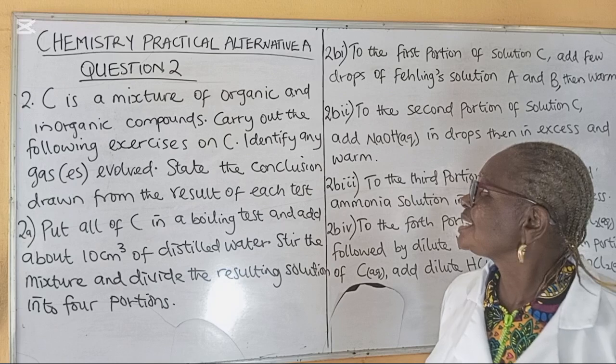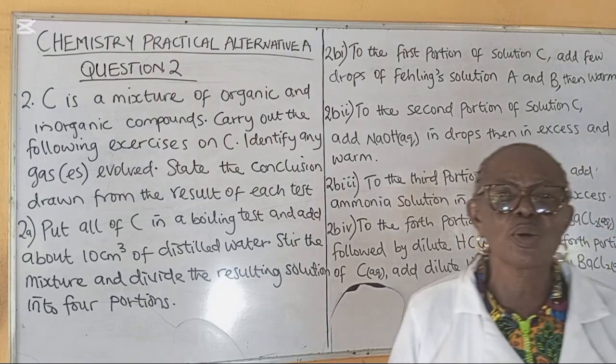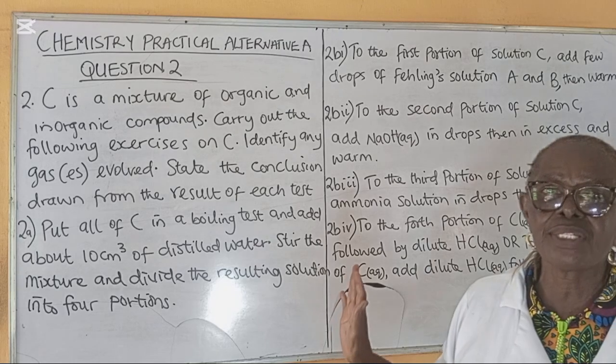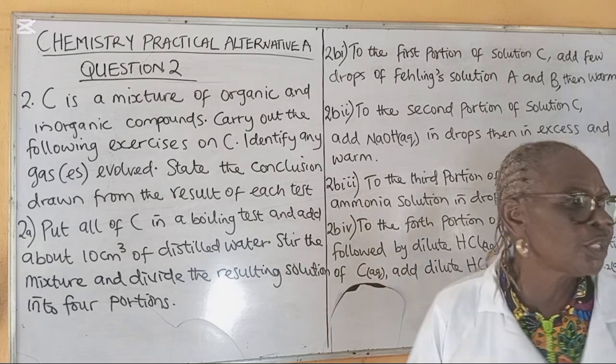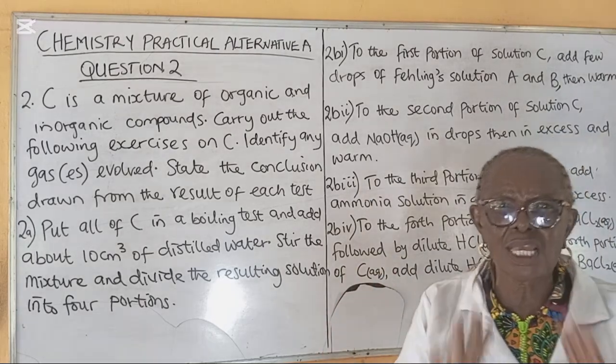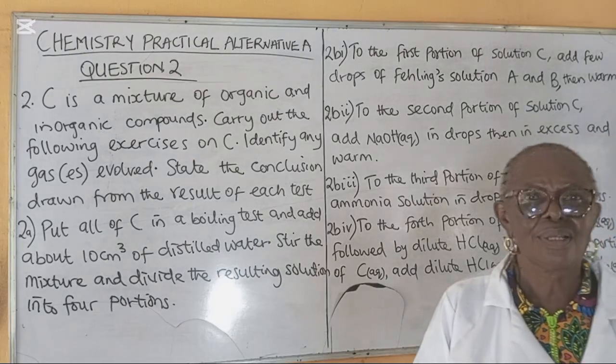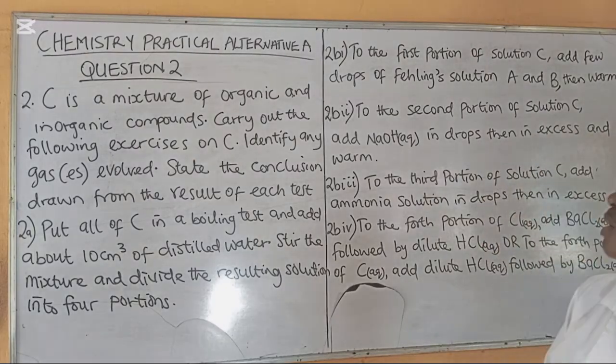Okay, my viewers, this time around, I want us to look at question number 2. I have it already on the board. I have to read it, and after the reading, I will do the demonstration and I will tell you exactly how you are going to present your reports. Question number 2.